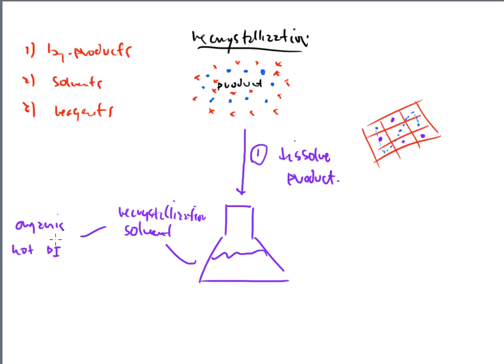That's it. And that really depends on the type of product that we are forming. Do we have an inorganic product, a salt that can easily dissolve in water? Or do we have an organic product that has formed a solid that does not dissolve in water very well? Those are the 2 major issues that we always look at when it concerns the recrystallization solvent. So when I add the recrystallization solvent to it, sometimes I can just add the solvent, call it a day. But other times I want to heat this up. And this is very good for me.